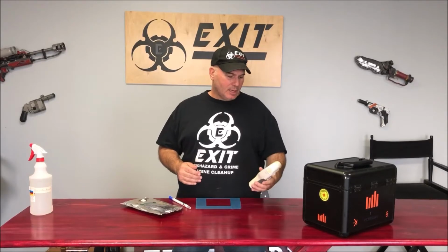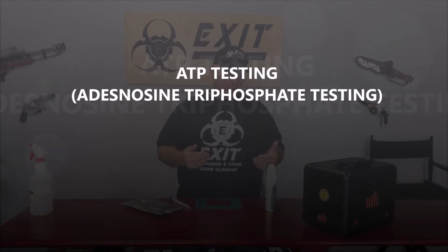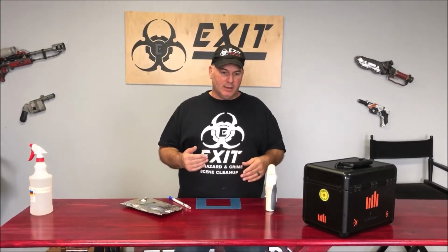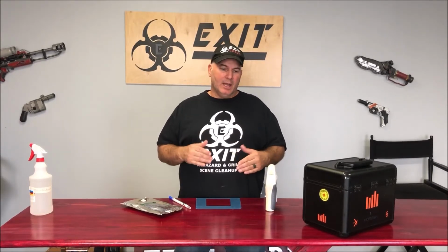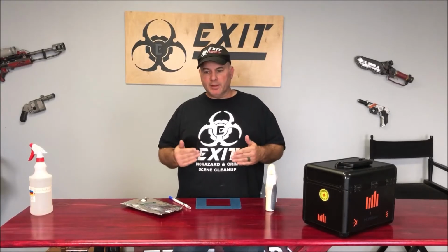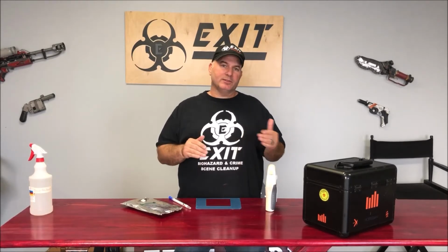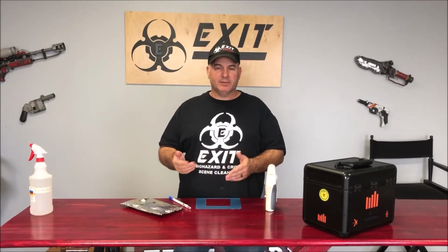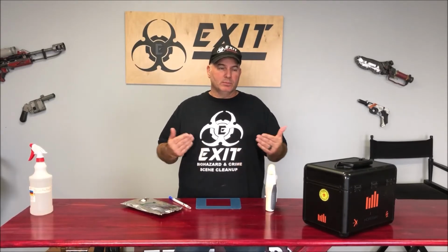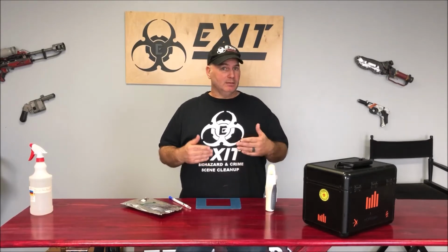ATP testing stands for adenosine triphosphate testing, which is a complex way of saying we're looking for a specific molecule that's in living things. Somebody smarter than me has determined that that is a way of checking for cleanliness. Cleanliness is a relative term. Some people may see something and think, oh, that looks clean, and other people think, oh, that's disgusting. Depending on how you test for it, it depends on what you consider clean, or more importantly, what other people who hire you may find clean.